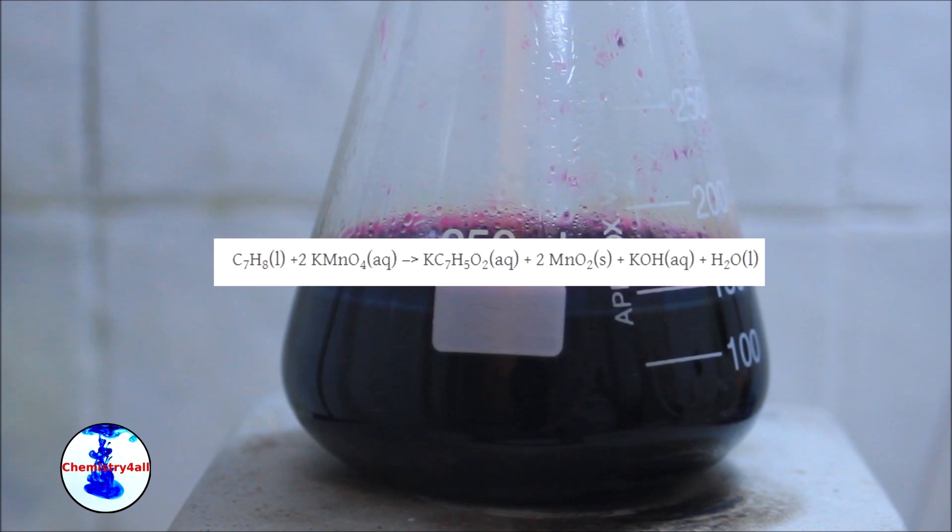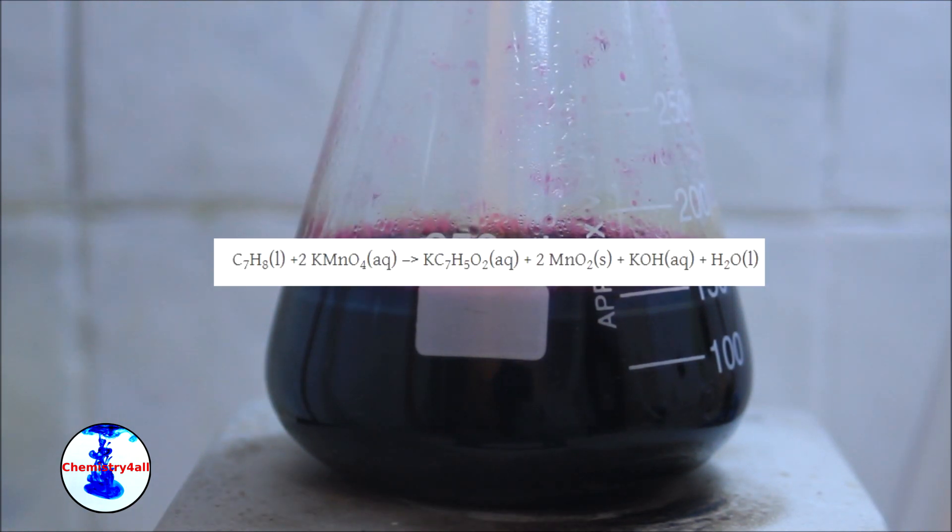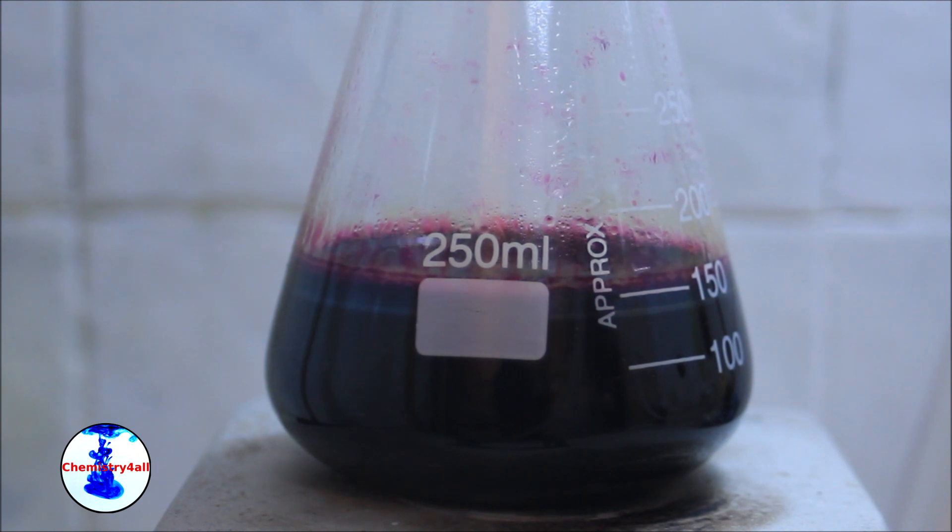The overall reaction taking place can be described by the following chemical equation. As you may have noticed, we have used an excess of toluene with respect to the stoichiometric ratio. This is done to avoid the presence of unreacted potassium permanganate as well as secondary reactions.